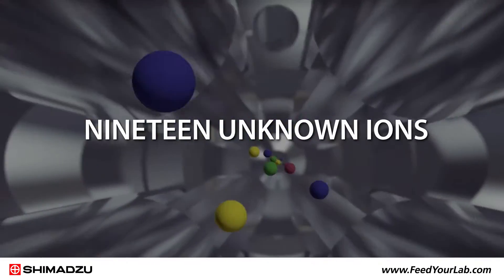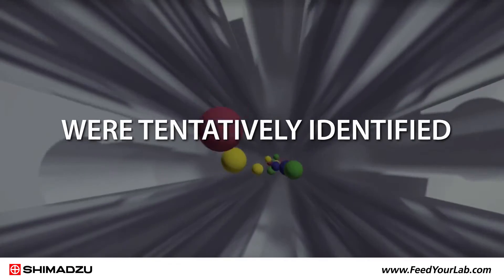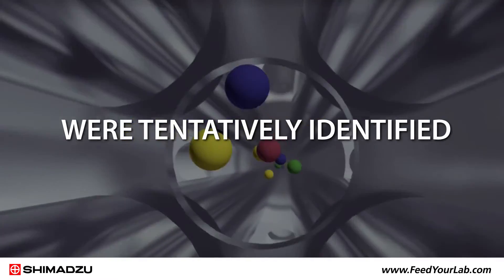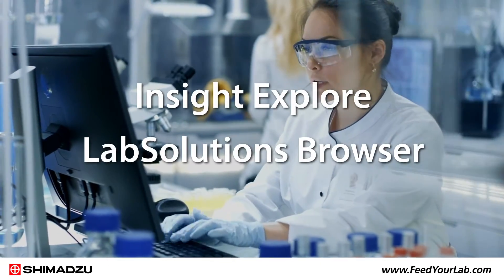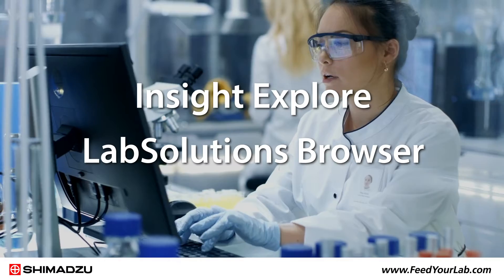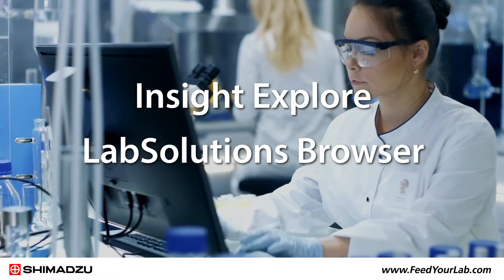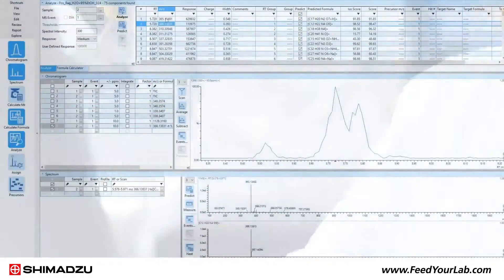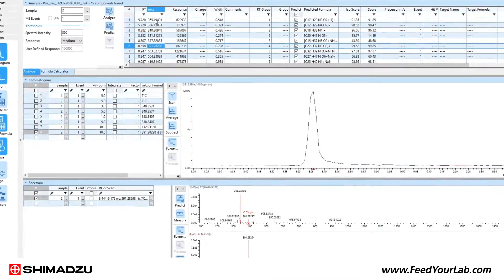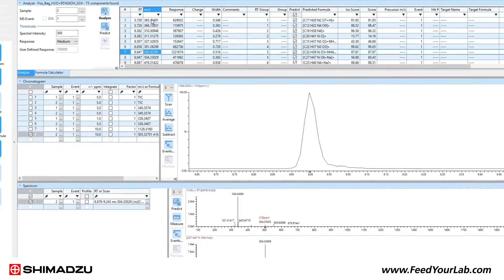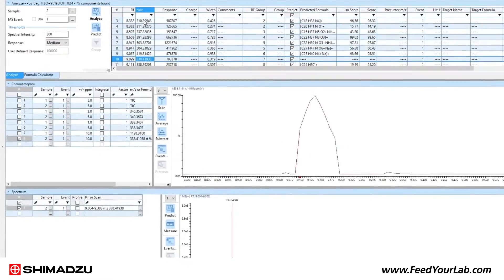Nineteen unknown ions from both positive and negative modes were tentatively identified. Shimadzu Insight Explore and LabSolutions Browser were used to screen feature ions. The identities of these unknown ions were investigated using a formula predictor according to the accurate mass and the isotopic ratio.